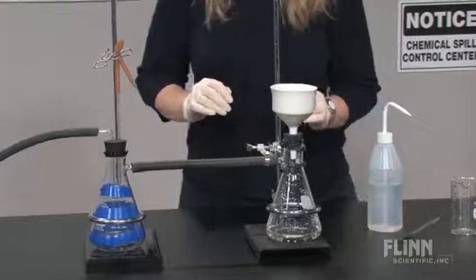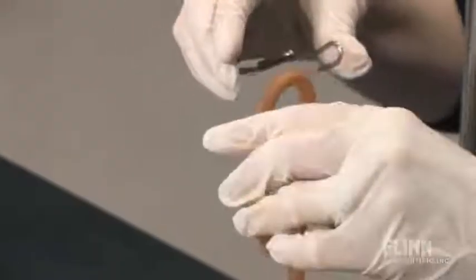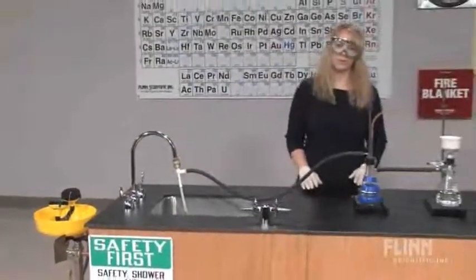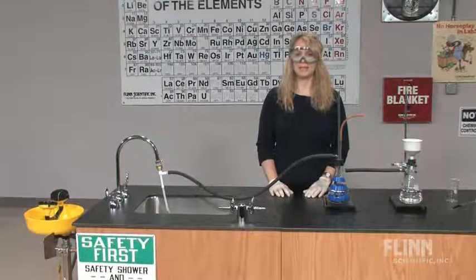Dry the precipitate as desired, then release the vacuum and turn off the water flow. It is important to equalize the reduced pressure of the filtration assembly before turning off the water flow to the aspirator. When correctly using lab filtration, it can save quite a bit of time both in the filtering and in the sample dry time.